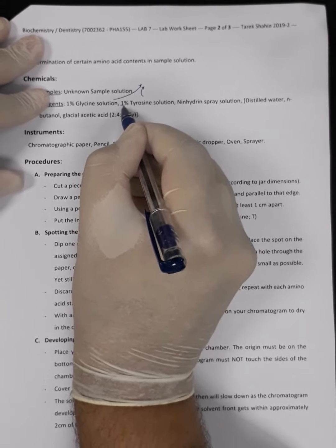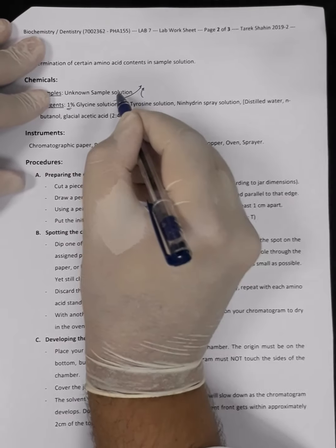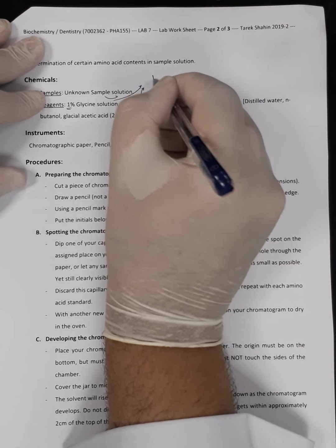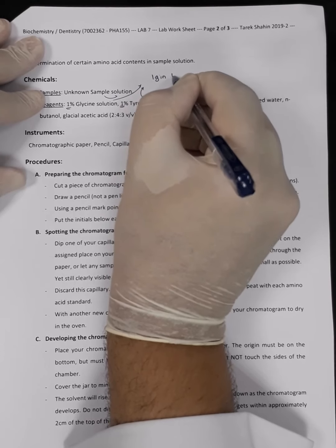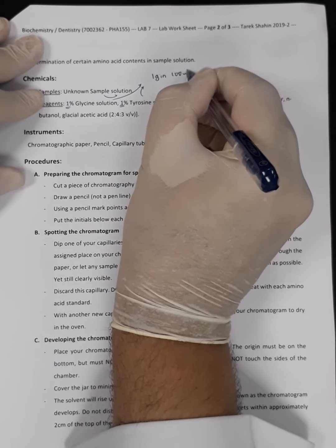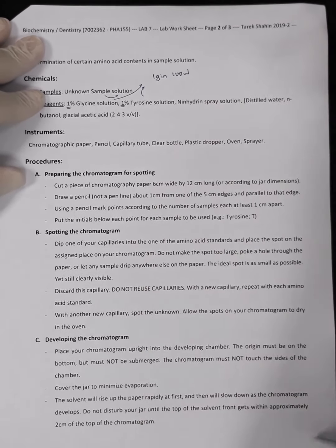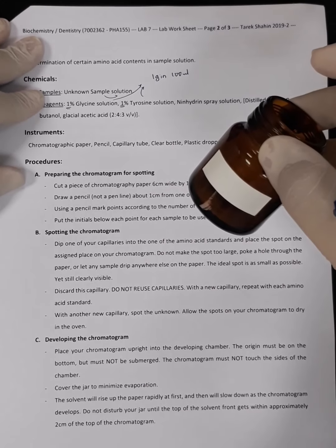Both of them, the concentration is 1%, and even the sample solution, all of them are 1%. So how are we going to do that? Simply, we know that 1% means 1 gram in 100 ml. But we don't want to prepare 100 ml. We don't want to waste our standard. So we will use the 25 ml jar.